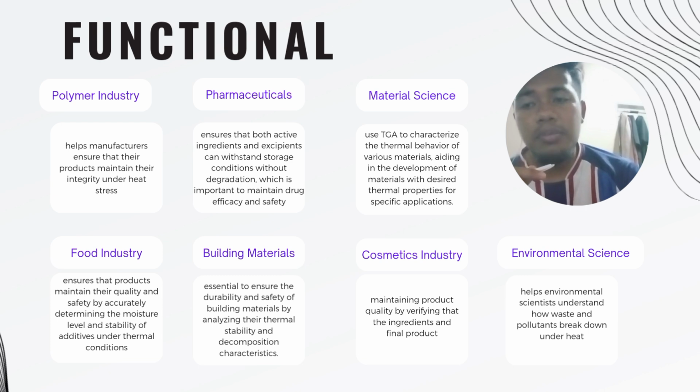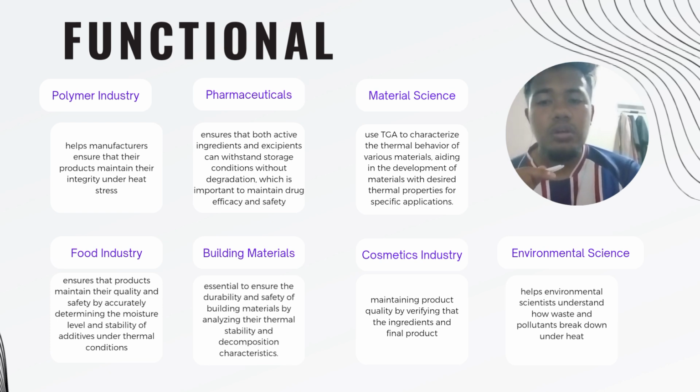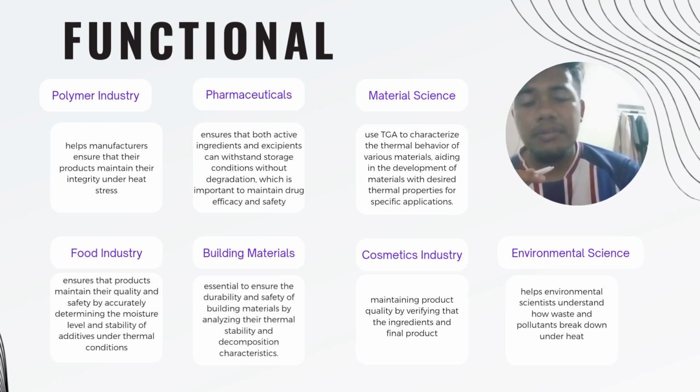7. Cosmetic industry. In the cosmetic industry, TGA helps maintain product quality by verifying that ingredients and final products can withstand expected storage and use conditions without degrading.